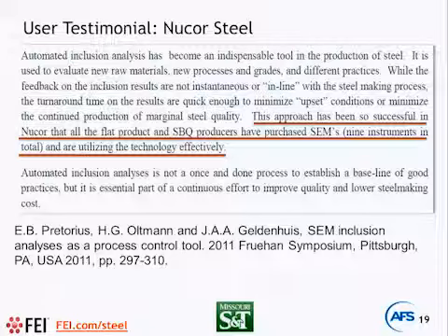As I mentioned before, today automated SEM-EDS analysis is not used in foundry practice. However, I will show you right now how this tool will be very powerful to understand our casting problem and improve our technology.